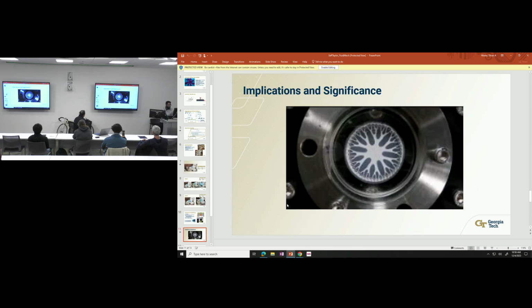And this is just a video, which is not going to even work. It's not that important, but it's a video showing the use of viscous fingering to create those flow channels in 3D biomaterial prints. Again, it's showing the same thing, but there are multiple different ports. So when it comes together, it creates this branch-like structure.